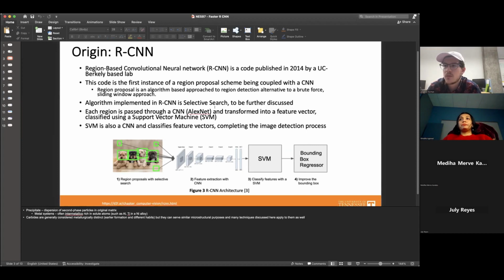That's correct. The first step is basically isolating features from background. And the second step is telling you what those features are, and they are not connected. Right. So if they're not connected, then it makes sense. Yeah, they're not. That's why our CNN is a little strange, and that's why it's so slow, because you literally have to train two completely discrete neural networks where the only thing those networks do is pass a vector into the next one, but there's no communication aside from that.